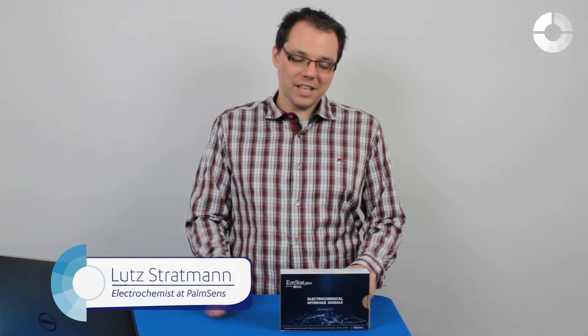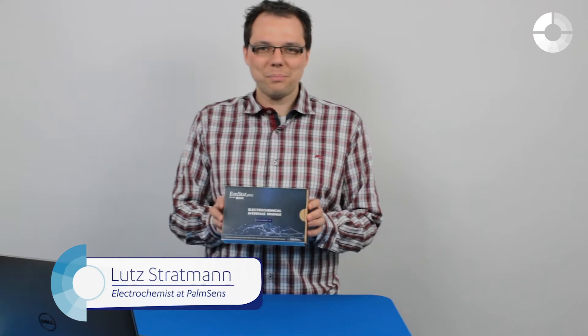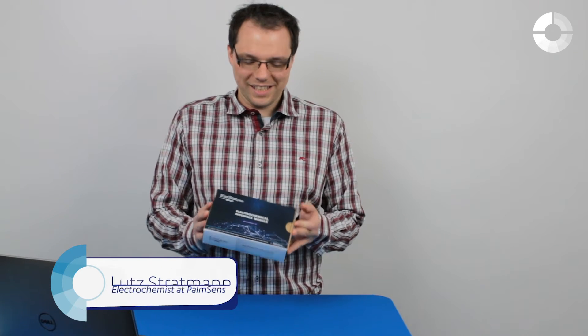I'm your host Lutz Stratmann and today we're going to unbox the EmStat Pico development kit.